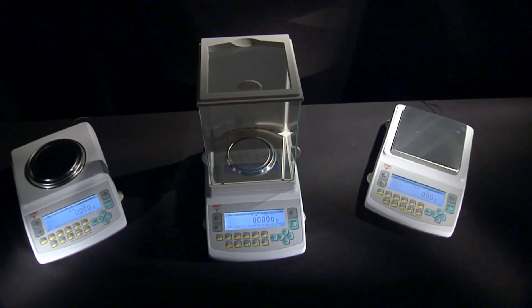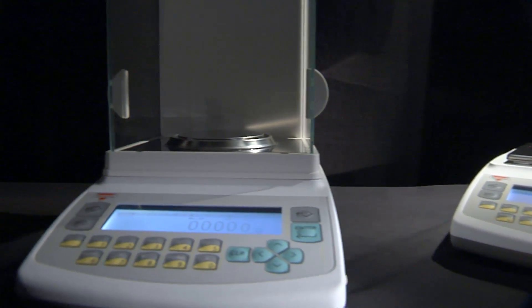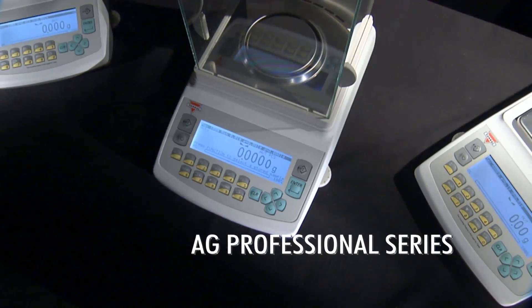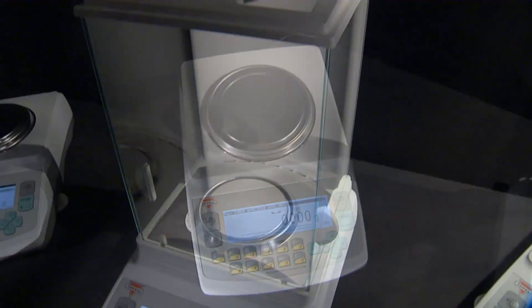An elegant and modern design combined with the latest metrological technology delivers the ultimate weighing performance. Introducing the AG Professional Series — Torbal's most sophisticated line of precision laboratory scales and analytical balances.